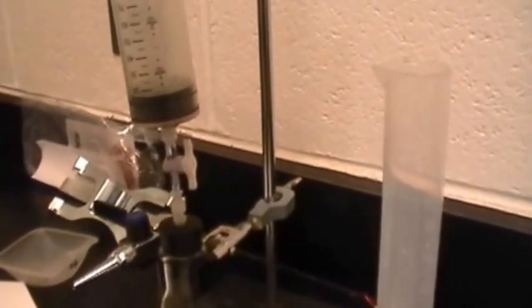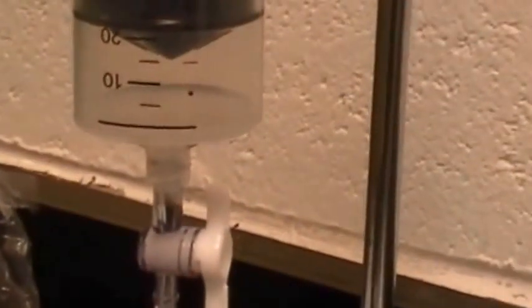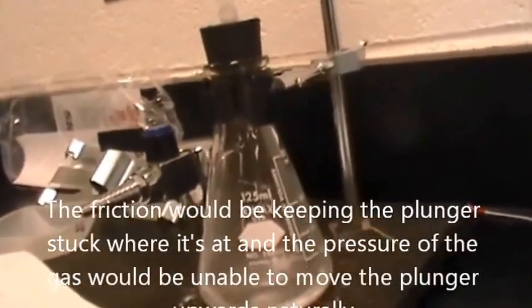Now we're on three minutes, and we just raised from about 13 to about 22 milliliters. You have to push it down and let it come back up in order to depress the syringe — because otherwise friction causes a problem.